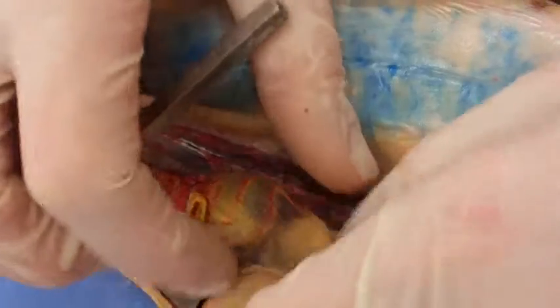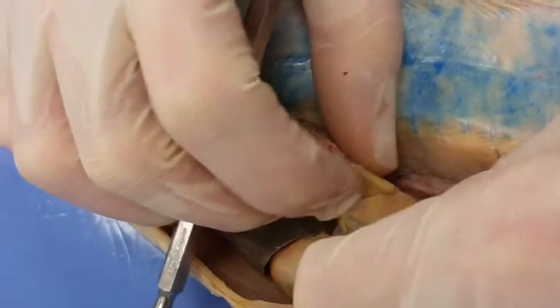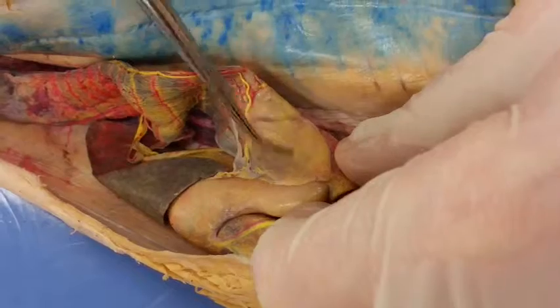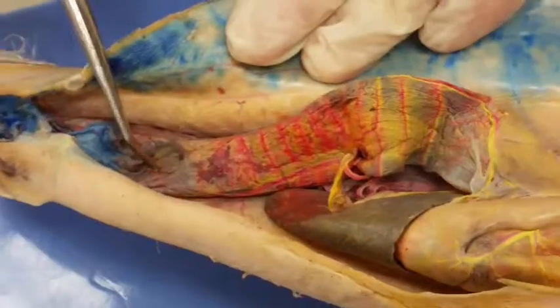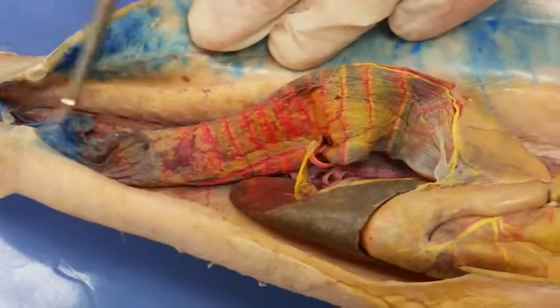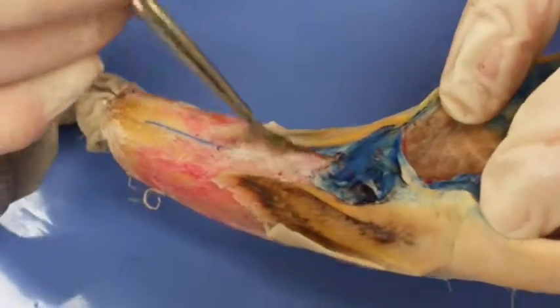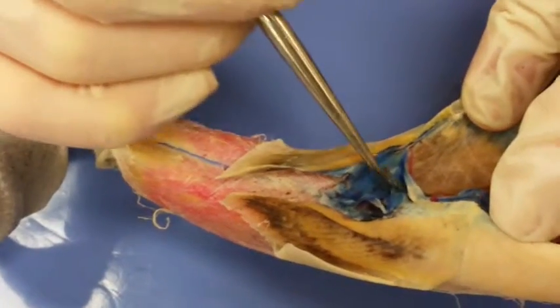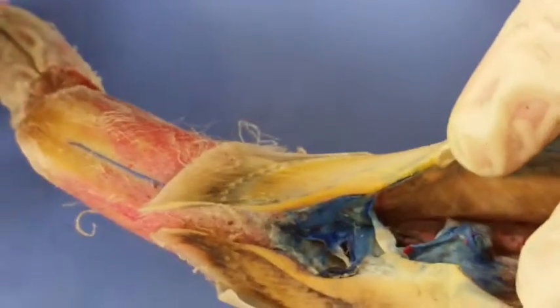And then we have the lobes of the pancreas. Once again, easy to see the pancreas thanks to the vasculature, but lobes of the pancreas right here. 1 and 2. Easy to see, 1 and 2. And then that leads once again into the valvular intestine, past the uterus, to the rectum, which we have cut open and dissected, so right there, rectal opening.